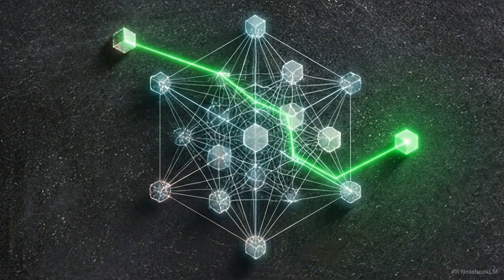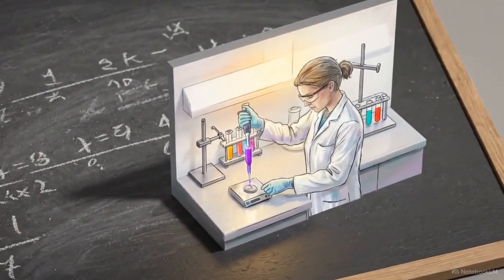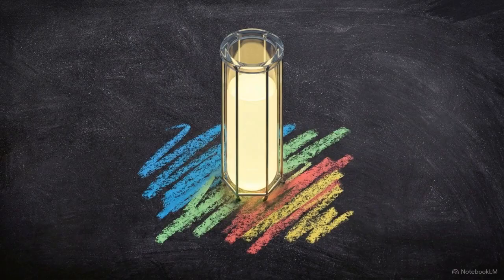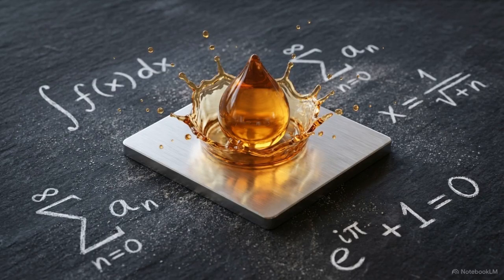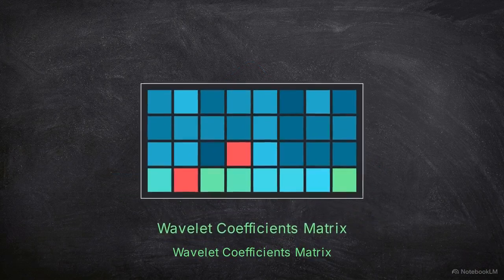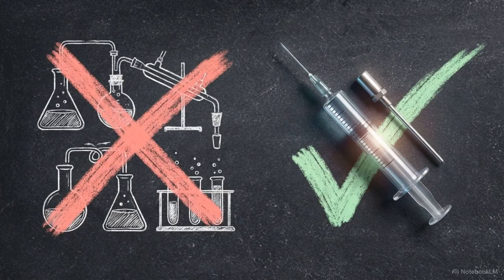clinical applications. We can now shift focus from the controlled training environment back to the real-world clinical targets from the beginning of our process. The system is deployed to evaluate 3 distinct human fluid pathologies: a harmless, benign transudate, standard lung cancer, and malignant pleural mesothelioma. Operating at speed, the raw fluid hits the ATR FTIR sensor. The amide 1 band is extracted, and the wavelet transform compression occurs instantly. ATR FTIR stands for Attenuated Total Reflectance Fourier Transform Infrared Spectroscopy, a technique that allows samples to be examined directly in the liquid state without further preparation.